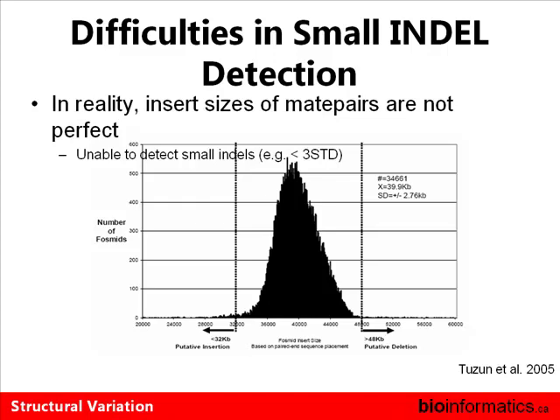And also by doing this, I think the mean was around 40,000, and they went to 32,000 this way, 48,000 another. They were unable to detect any event which is less than 8,000 base pairs. That's just the limits of the resolution. In their case, they had a 40K mean and 2.8 kb standard deviation of the insert size. And one thing to notice is that this distribution is completely not Gaussian, or does not have any other sort of nice shape or form.